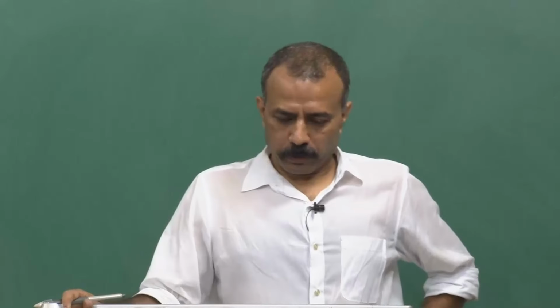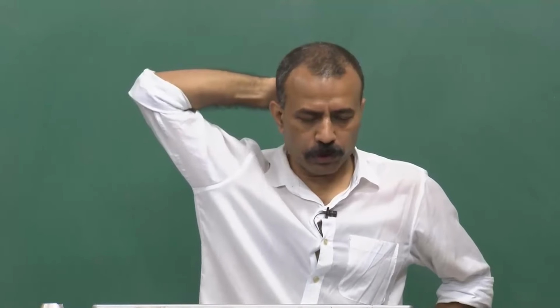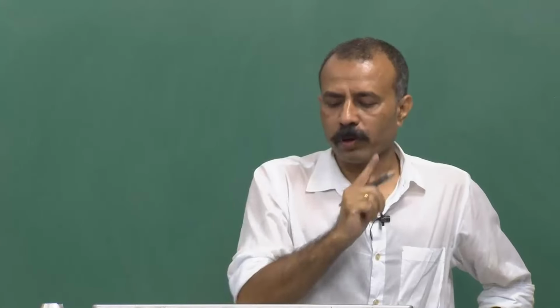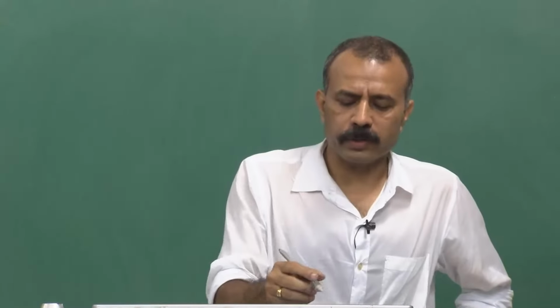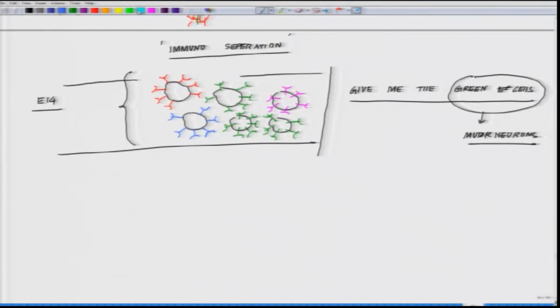So, at around E14, there are motor neurons. Most of the motor neurons express very unique receptors. I am just telling the story of how people went into immunoseparation of neurons, motor neurons, as a case study. Now, what they did was very interesting. In parallel, there was some individual who had developed earlier an antibody against this part, the one I am circling.